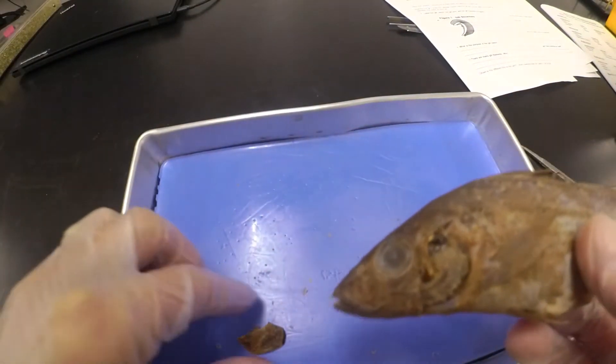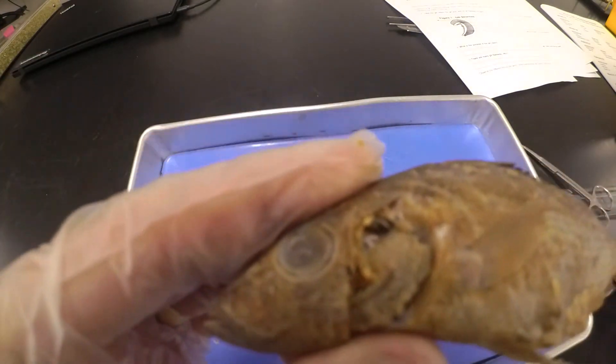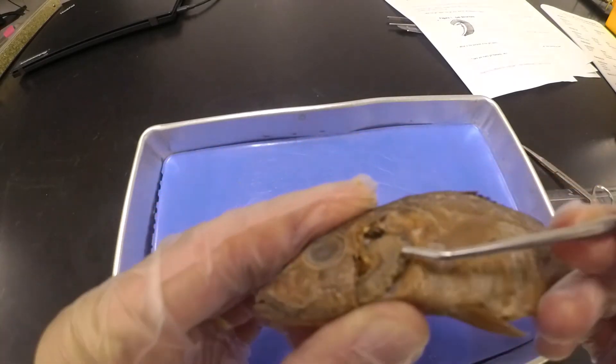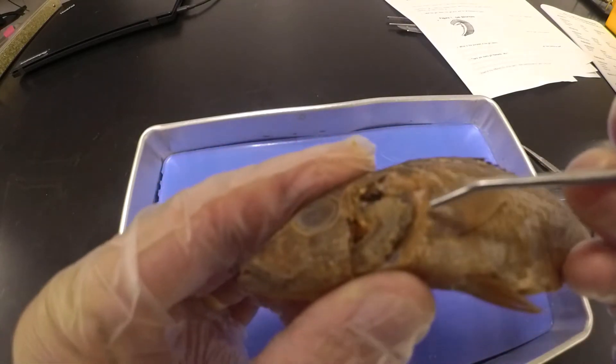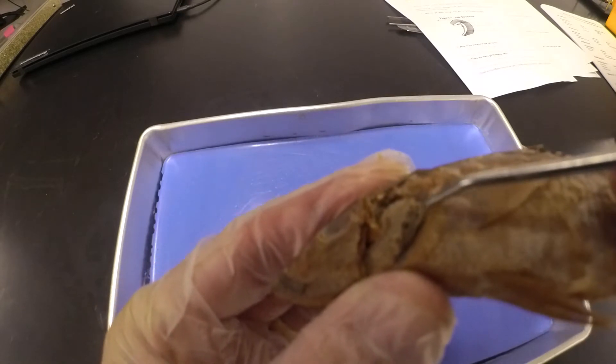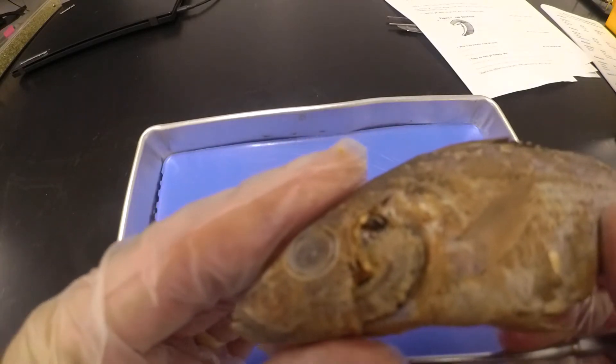So we've gotten that operculum cut off — you can see that right there. And we can see the gills, located right where that operculum was removed from. First it wants us to count how many layers we've got: one, two, three, and four layers of gills. So we've got four different layers with our gills.